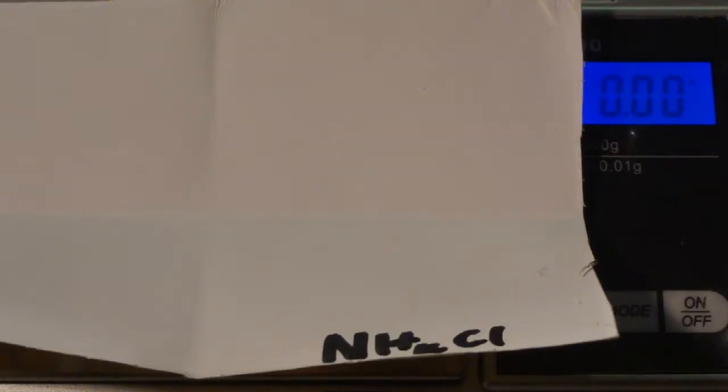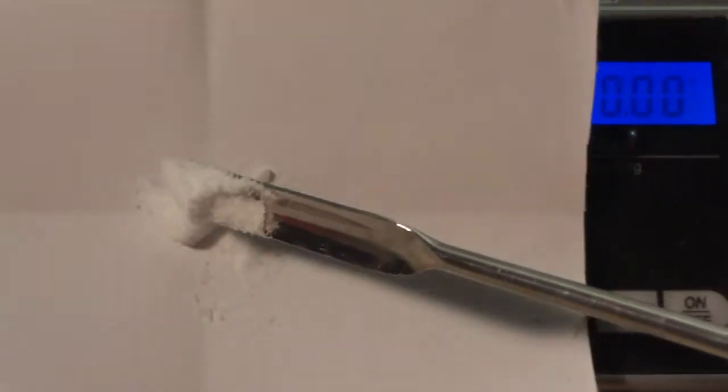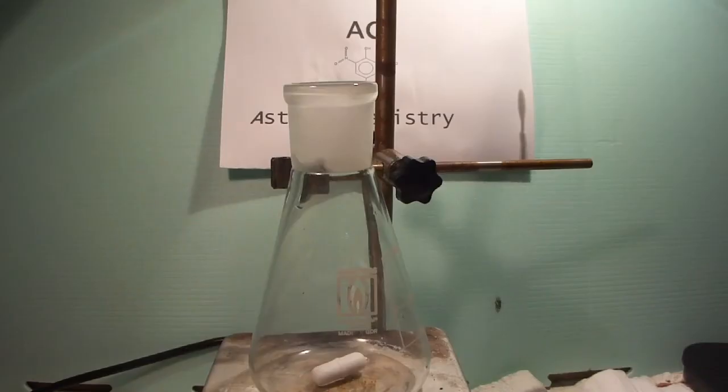Let's see how to prepare nitrogen in the lab. Start by measuring out 25 grams of fresh mouse caught in the laboratory. Ha ha, don't worry, that was a joke. Instead, start by measuring out 1.38 grams of ammonium chloride. Next, weigh out 1.78 grams of sodium nitrite.